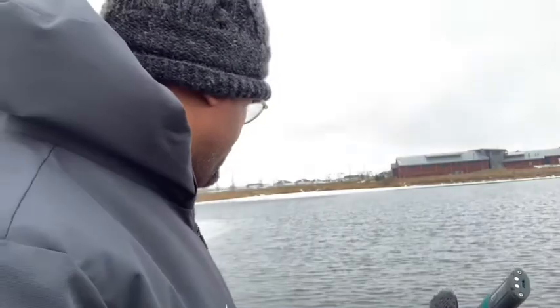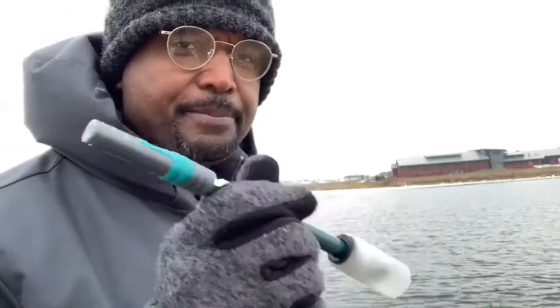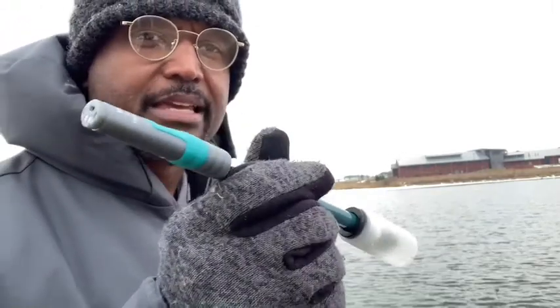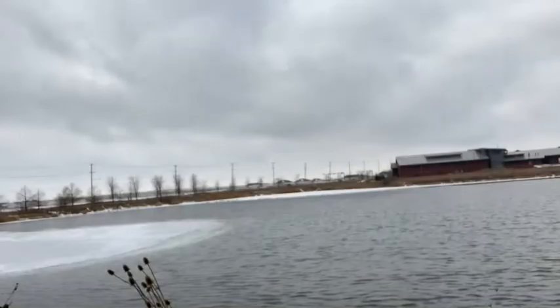And so we can use a pH probe, which looks like that, to measure the pH of the water. We might have to go out and get some water first, and then this is hooked up to an interface like my iPhone or a LabQuest in the lab, but I'll be using the iPhone for this. And so basically, I get some water. I uncap my probe here, rinse it off with some distilled water, and then put it in the water to test the pH.